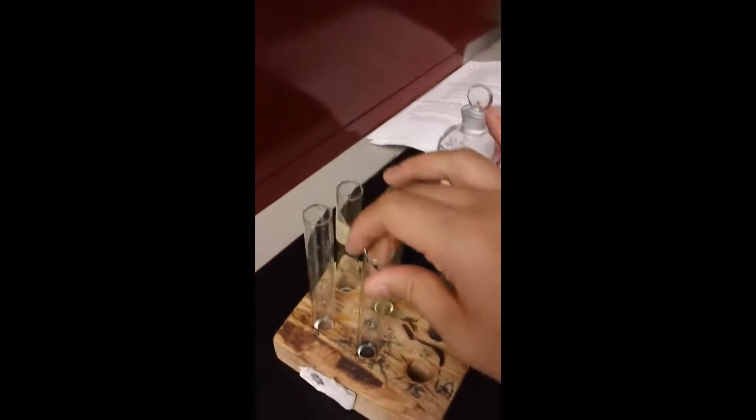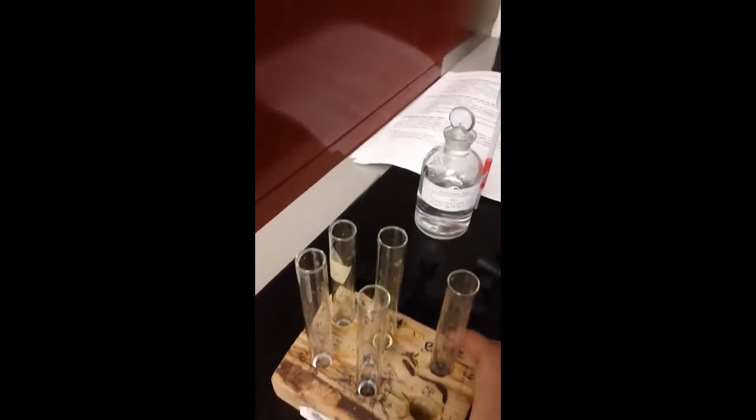HCl back on, and I want to gently mix each one. Gently mix. Okay, what I need to do now is add 10 drops of NH4Cl, so I'm going to take it over into the hood.